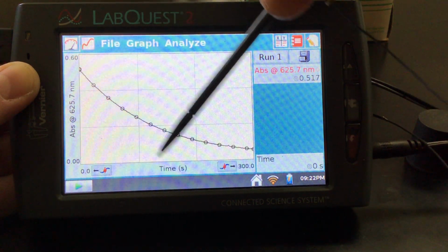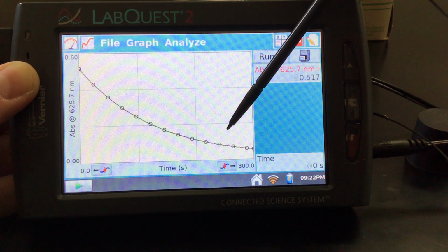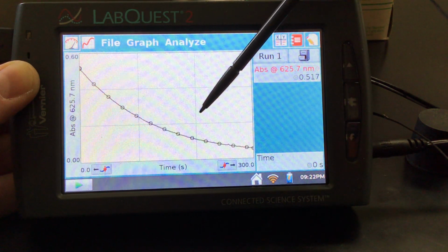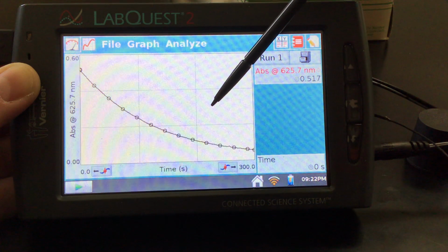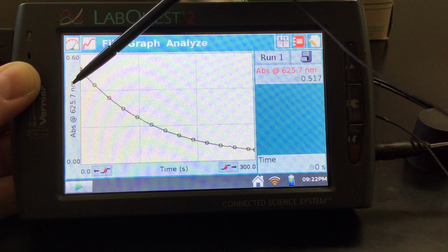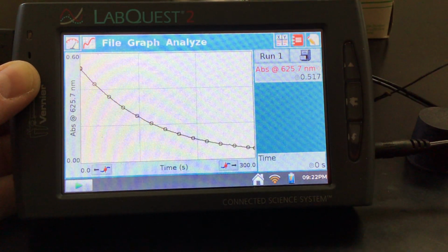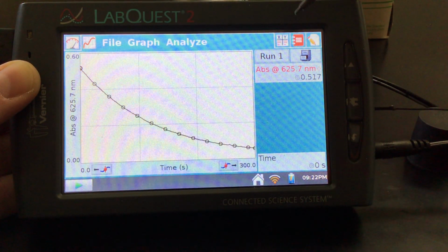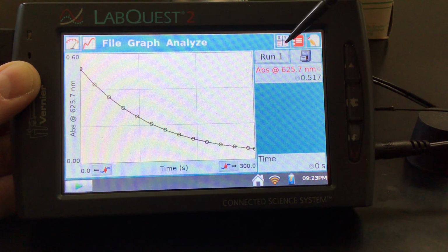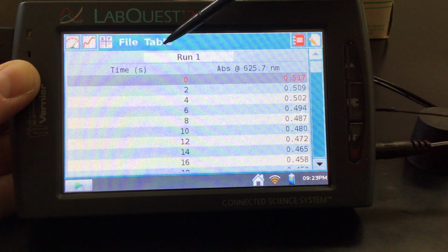If this was concentration versus time, since we're not seeing a linear relationship, we know that this is not 0 order. So what we would then do is analyze it and look at the natural log of that versus time, and 1 over this value versus time. On our LabQuest, we can do that by creating what's called calculated columns. So I'm going to go on the top right here to my table, and I'm going to create a new calculated column.